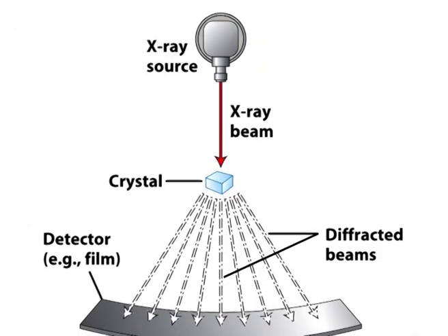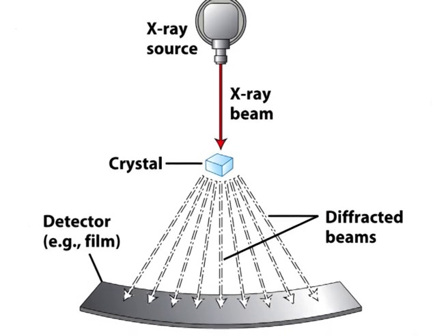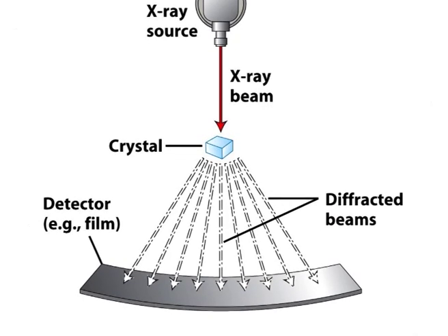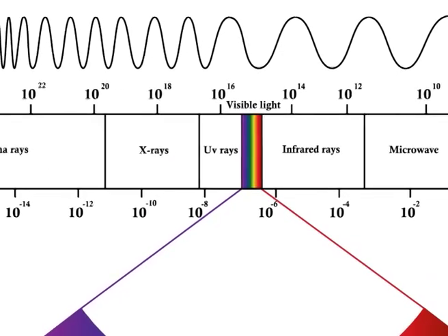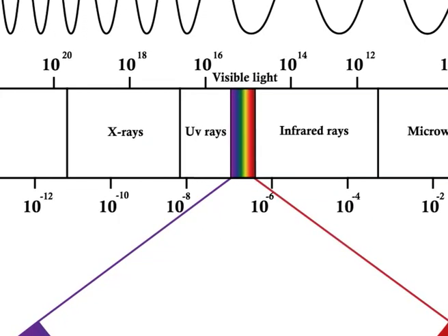In 1912, the exact nature of the X-ray was recognized, and the same year the phenomenon of X-ray diffraction by crystals was discovered. The discovery provided a new method for investigating the fine structure of matter. Now we know X-rays are electromagnetic radiations of exactly the same nature as light, but of a very short wavelength, that is 1 Angstrom. So X-rays are ideal to explore interatomic distances, which are typically of that order.